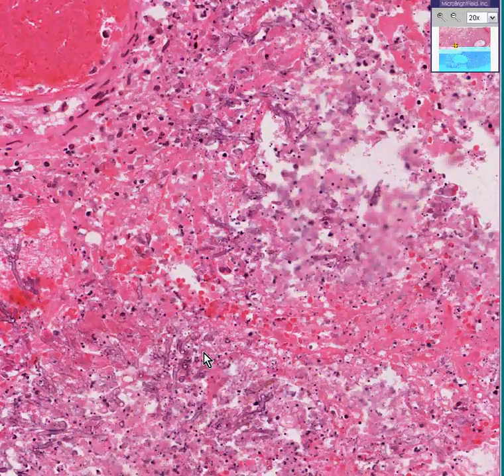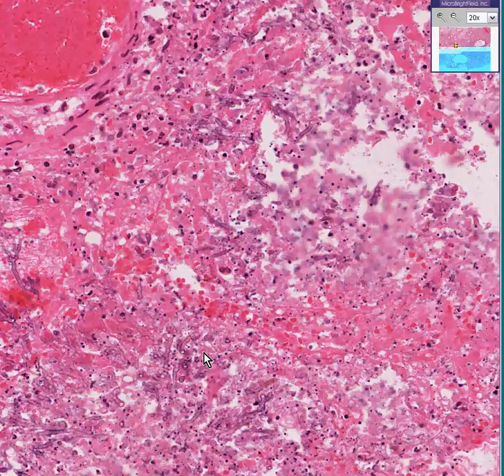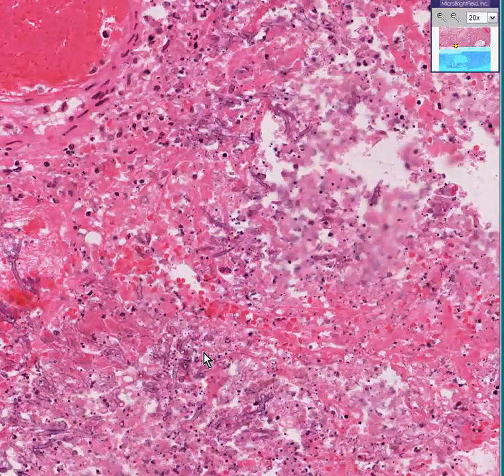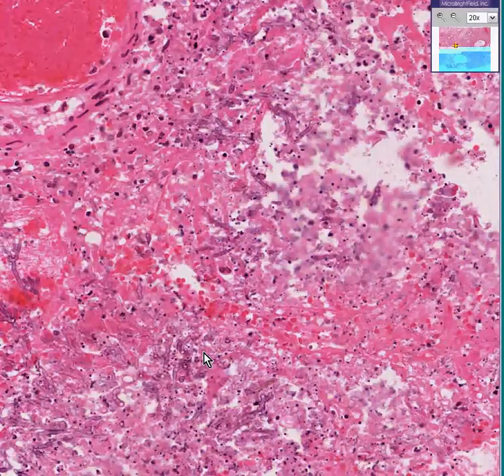So this is aspergillosis of the lung, also occurring in immunocompromised patients, as many or most of the fungal pneumonias do. Thank you very much.